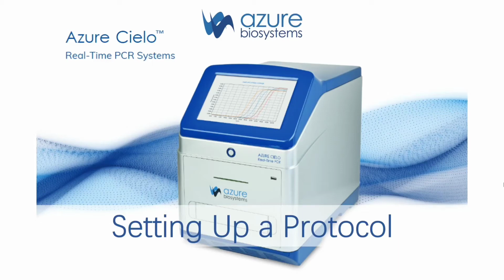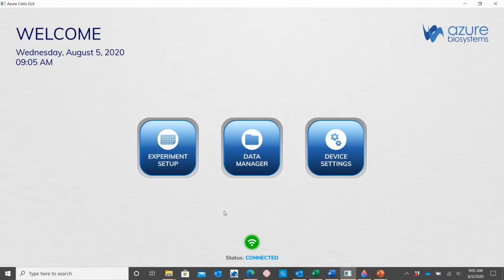This is Joy with Azure Biosystems, and today we're going to go over how to set up a protocol on the Azure Cielo real-time PCR system.